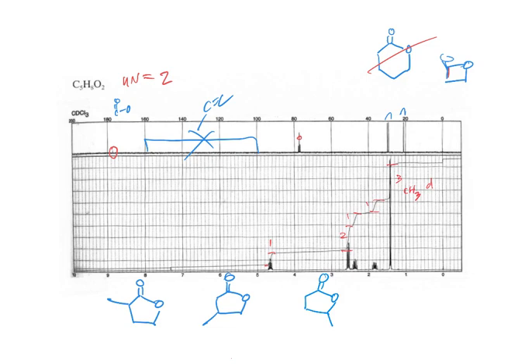Don't guess. Well, okay. There is a piece of data here in the splitting in the proton, right? Well, maybe. Maybe even something simpler than that. The number of protons we have are 1, 2, 1, 1, 3.